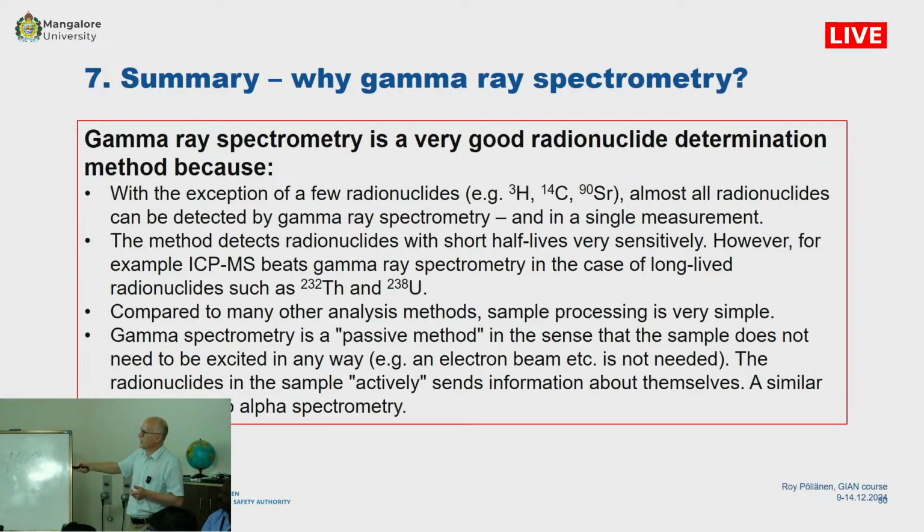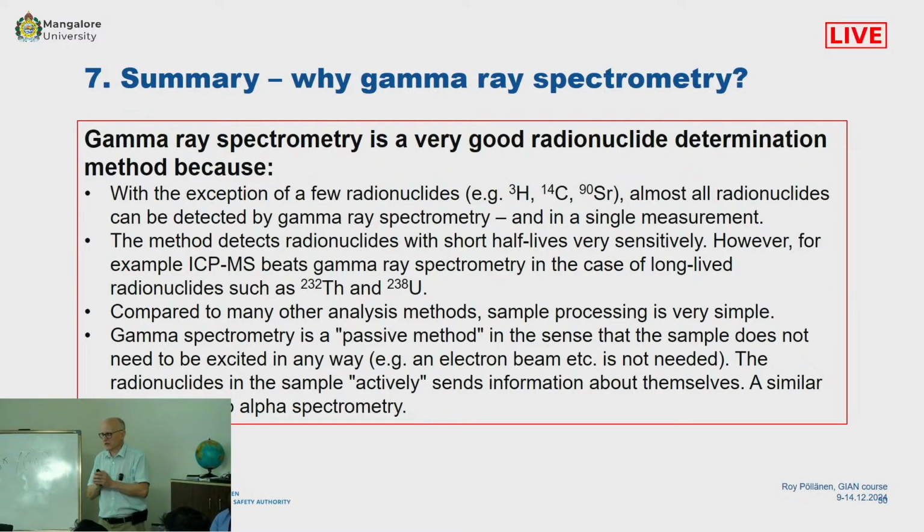So I already explained this. It's a so-called passive method, which is not a good definition because we actively do something, but the point is the same for alpha spectrometry.